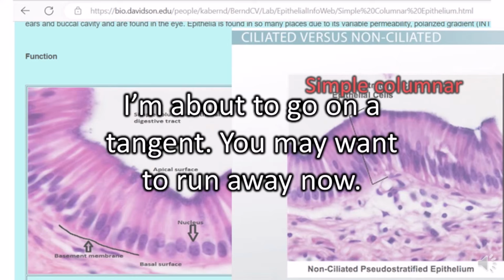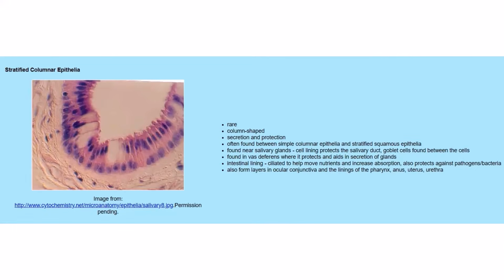But now I do think they were right, but then on this same website, I found this picture, which they're saying it's stratified columnar. Those are very clearly, obviously cilia. And now I'm thinking, was I wrong? Can stratified columnar have cilia in something that's not a fetal esophagus?